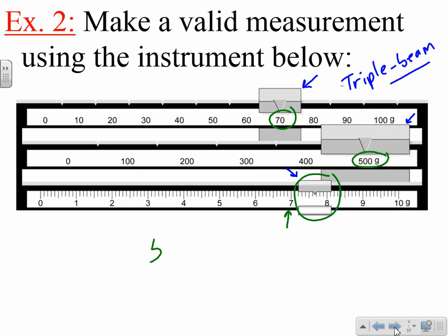And now we have to take a look at this portion here of the last rider. It looks like we are between the 6 and the 7 on the last rider. So this would be a 5. That number would be a 5. So that would be a 6. And then that would be a 7. So it looks like we are definitely between a 6 and a 7. And so we'll put .6. And then we have to estimate the last digit. The estimation is between a 6 and a 7. And it looks to me like it's a little bit past the halfway mark. So maybe it's a 6. So we'll say .66. So you have to have two decimal places past the point in this measurement. Hopefully that made sense. Don't forget the units. The units in this case are grams. So your final answer is 577.66 grams.